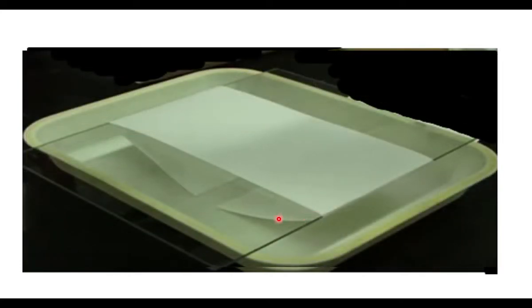Now the edges of the blotting paper touch the buffer kept inside the tray. Due to capillary action, the buffer is drawn upwards. The buffer reaches the surface of the filter paper. Here the filter paper acts as a wick. In chimney lamps, the wick thread draws the oil to the top. Here also, due to capillary action, the buffer is drawn upwards.